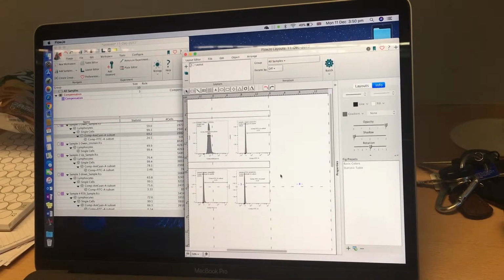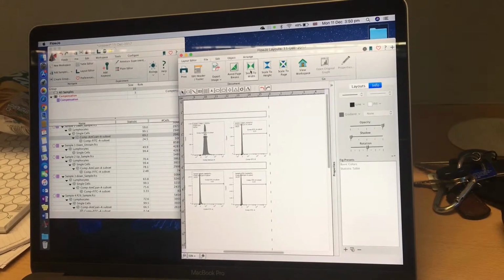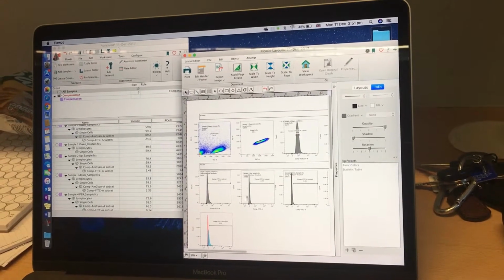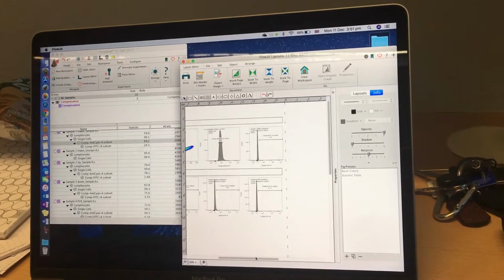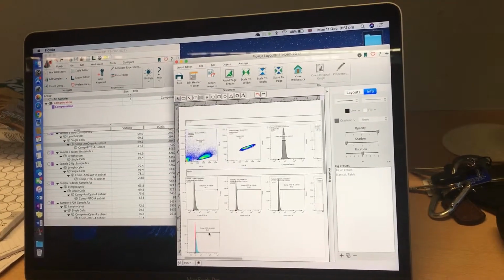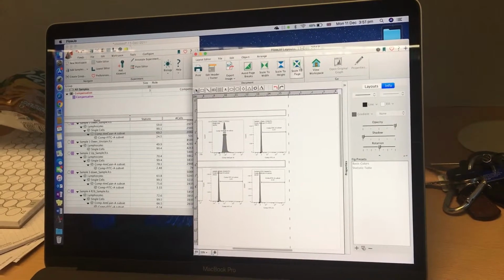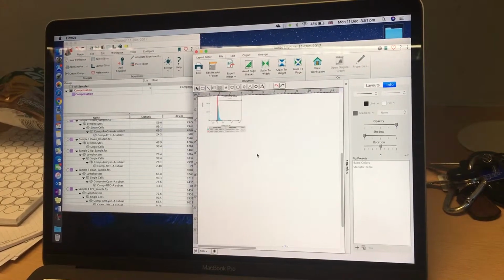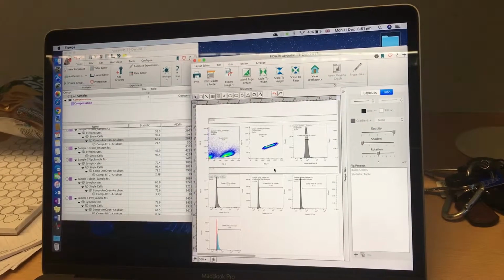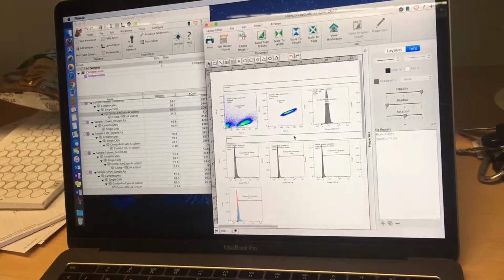And then if you want to put it on the same page, you know how to do this bit, right? You just hit scale to width. If you put scale to width, it puts it all onto one page for you. So when you print it, it prints on one page. Good. You put scale to page, and it scales it. And then you export as page.